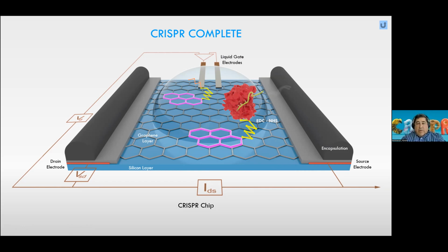Now, we can certainly take this further and we can bring an amplicon in. And after that, if we would like to see the amplicon binding, we can measure that. And then subsequent to the binding, we can also introduce magnesium chloride conditions and see cleavage. So I'll show you what our data looks like, but really we can stop and assess any one of those processes, either in itself or go all the way to the end here and do an actual cleavage assay. And we can repeat that with different guide RNAs. We can repeat that with different amplicons. We can change some of the conditions if needed. But this is basically a CRISPR assay that goes on every day here at CRISPR QC in the lab.